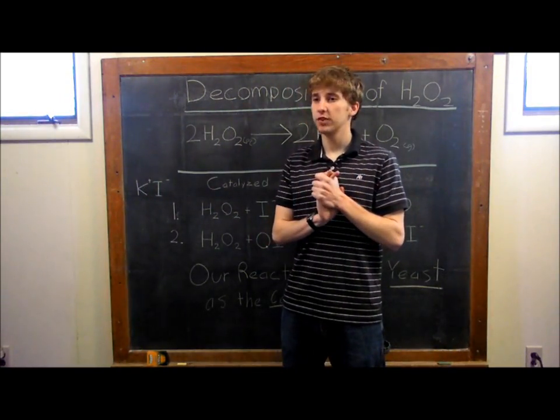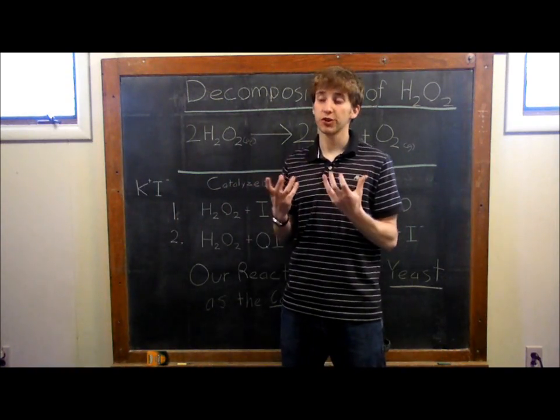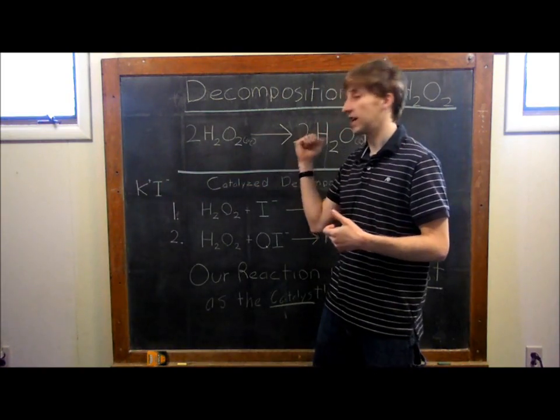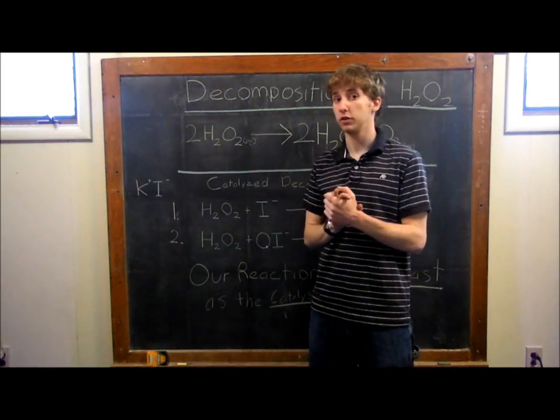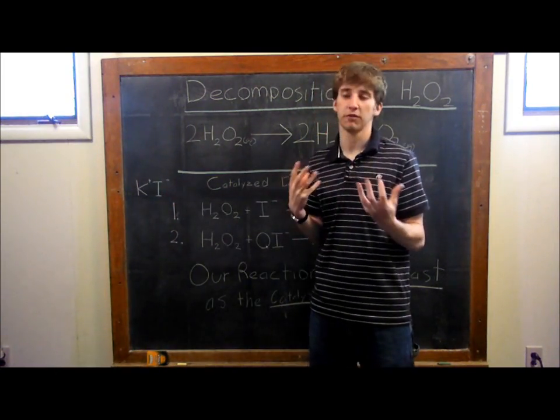So, I've just realized we don't have any potassium iodide to use for our reaction. So, unfortunately, I'm not going to be able to show you the potassium iodide catalyzed decomposition of H2O2. Luckily, however, I have a little something called yeast. Now, yeast and potassium iodide are two very different things.